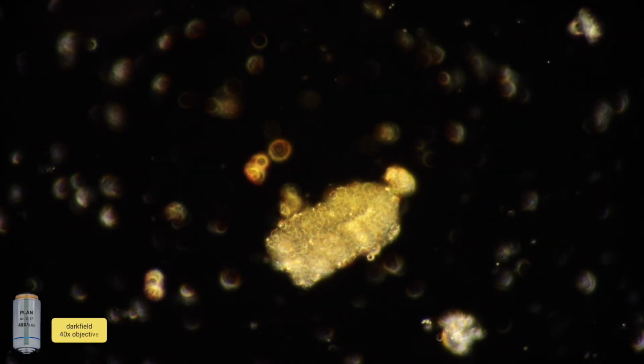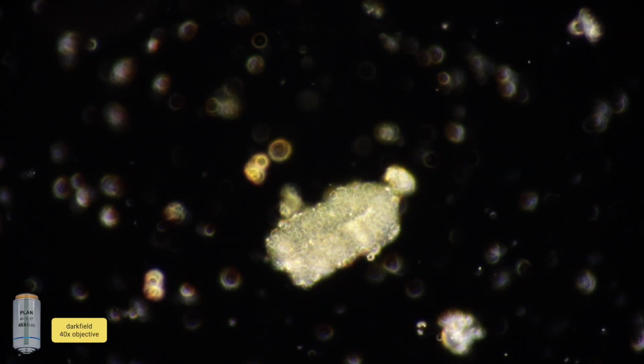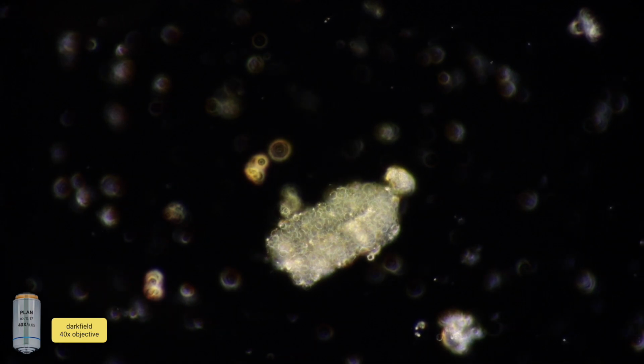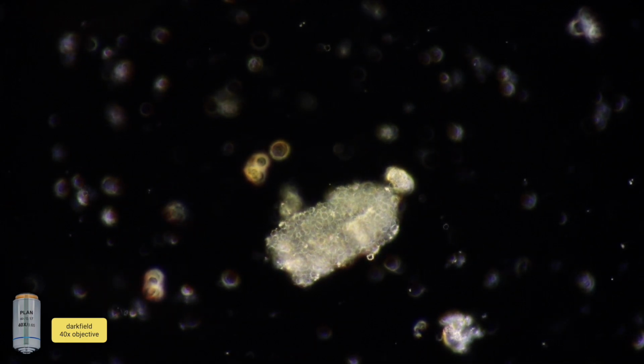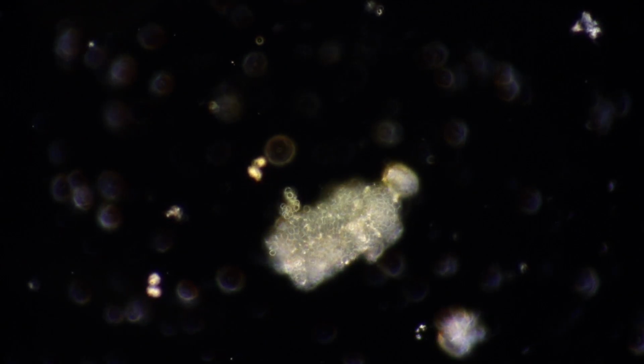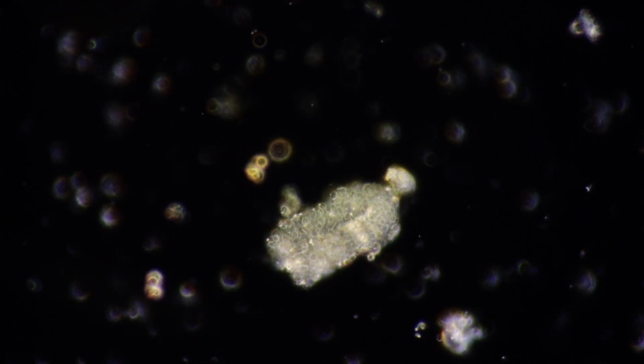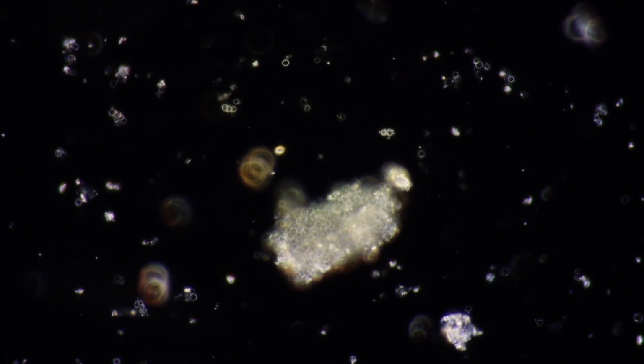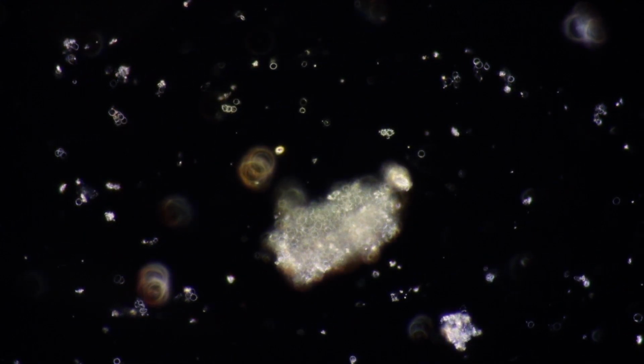Now we're under dark field. We can adjust the lighting a little bit, get a better image. You can see the outline of the red blood cells in the cast. You'll also notice in the background, as we focus up and down, we can focus on the red blood cells in the background and very clearly see the outline.